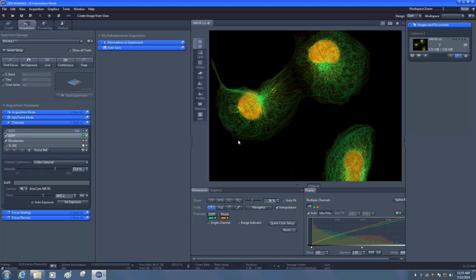Alright, so using ZEN should really be that easy. But let's back up and discuss how to ensure that this is the workflow your system is using. First, note that my ZEN Channels window was already populated with a number of options. I have 3 fluorophores listed here, as well as a transmitted light channel. I can, of course, use these channels for any equivalent fluorophores.